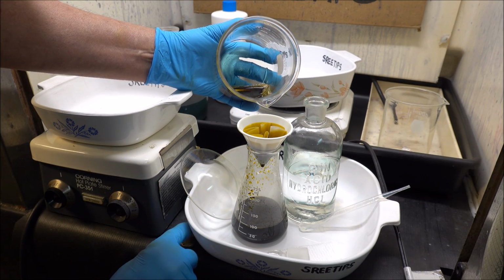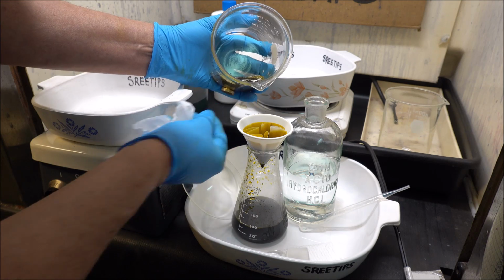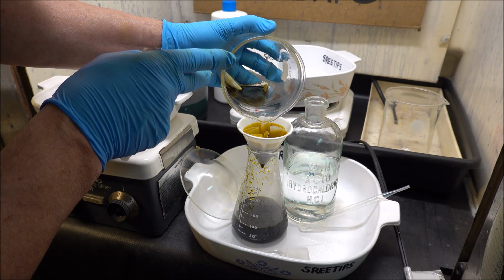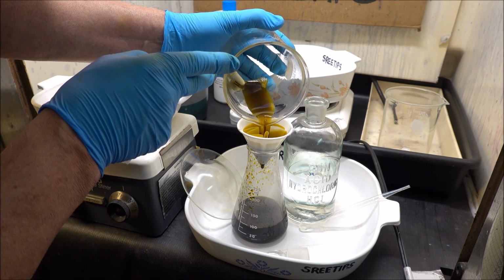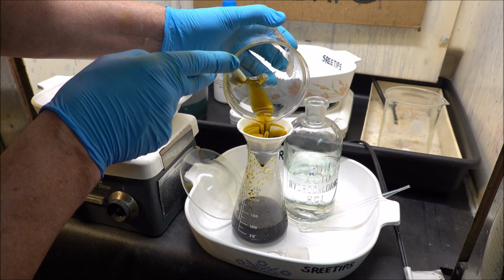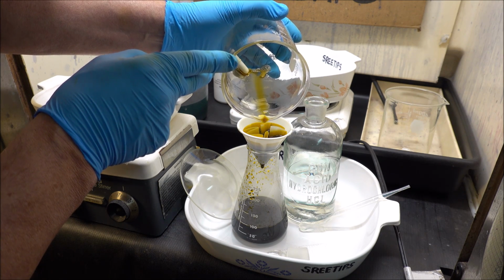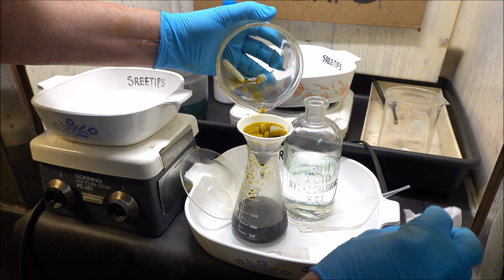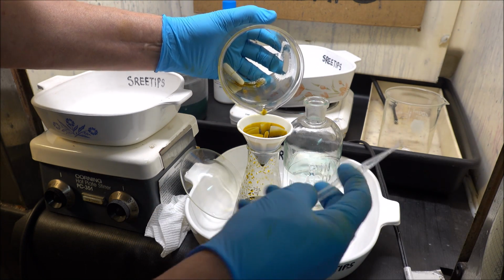Okay, we're getting down to the bottom of the beaker here. I'm going to put a magnet on there to keep the stir bar in so it doesn't come flying out of there. And as you can see, all the metal has been put into solution. There's no solids left in the beaker there. And that's what we want to see.